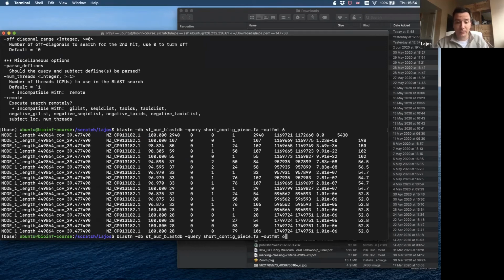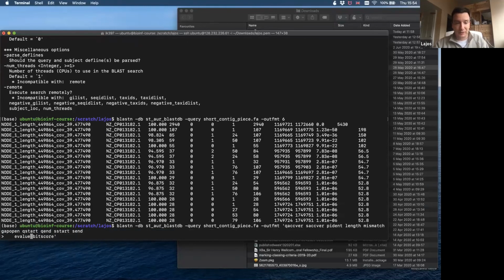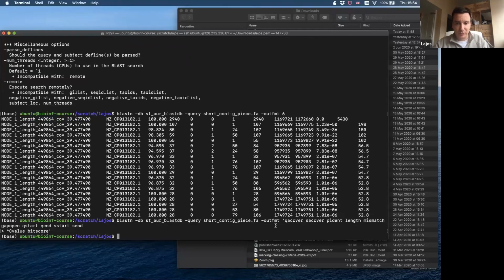So I just go up. It's a bit strange because the way you have to do this is, oh, nice. It went to a new line, sorry.